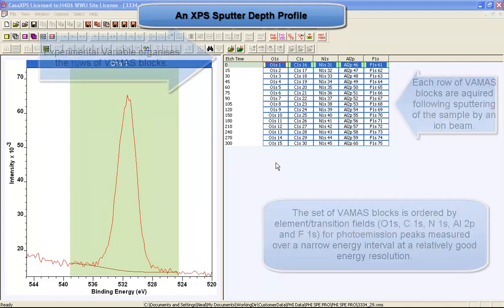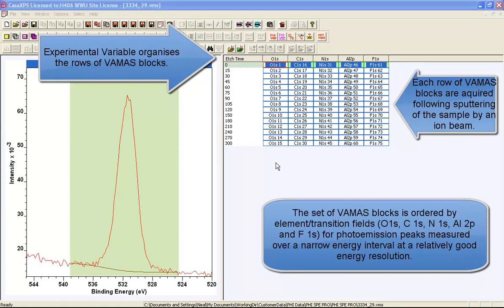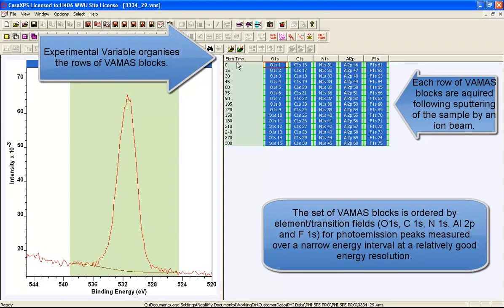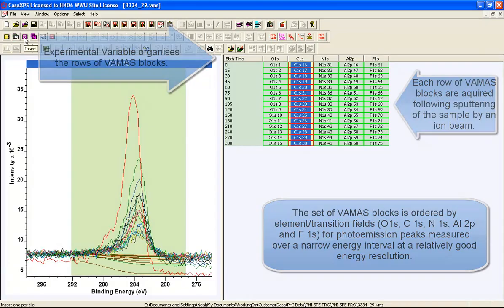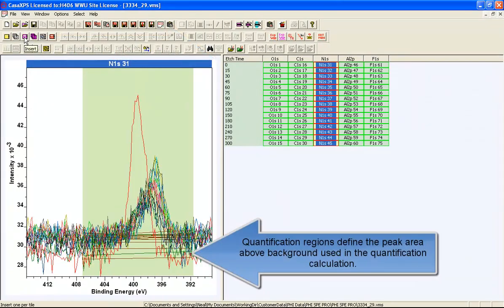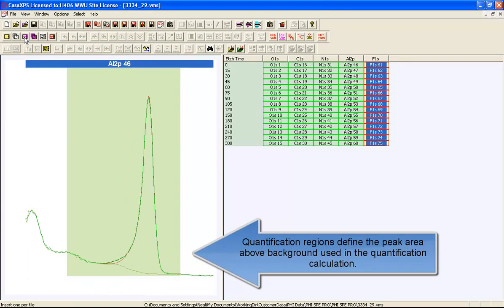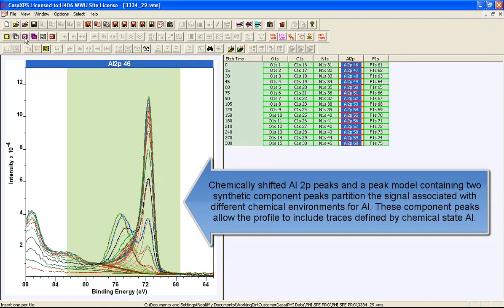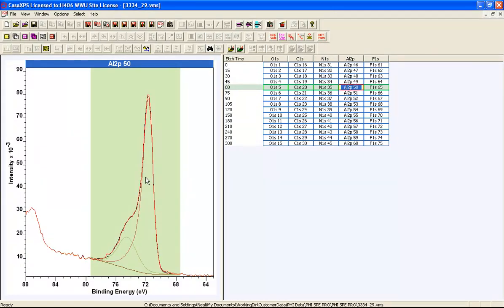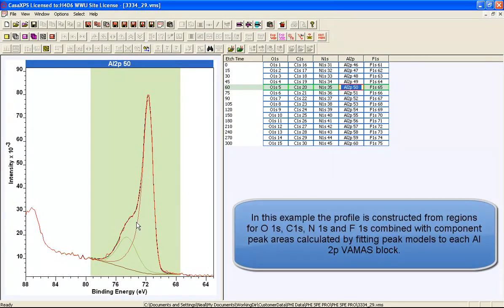In this video we're going to look at how to display a depth profile measured by XPS with etch cycles from an ion beam. These data have been organized so that a set of high resolution scans have been measured and regions are defined on each one, with the exception of the Al2P where both a region and a pair of component peaks have been used to separate intensity from two different chemical states for aluminium.